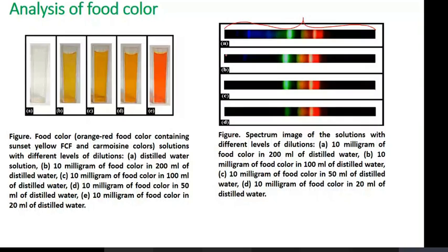Okay, so once you get this image, you basically take the pixels which are in a particular line. In our case, we took say 4 to 5 layers of the pixels over here, and we got the readings. So what I am talking about is, say, you'll be getting pixels like this.